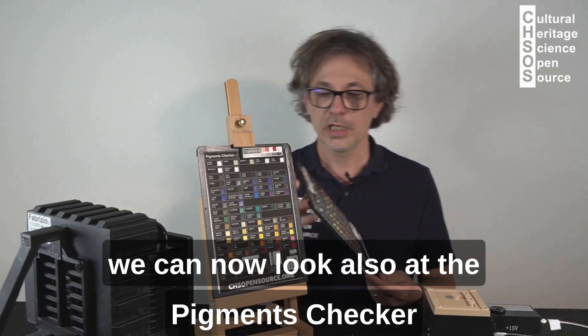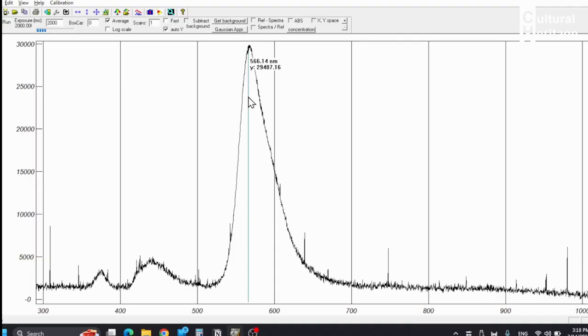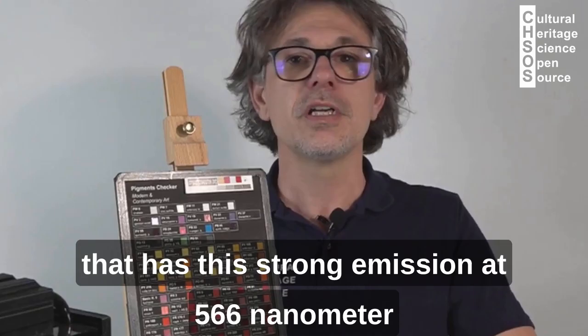We can now look at the pigment checker Modern Art and measure the fluorescence of Eosin Lake — this strong yellowish color over here. Now we are looking at Eosin Lake, which has a strong emission at 566 nanometers.